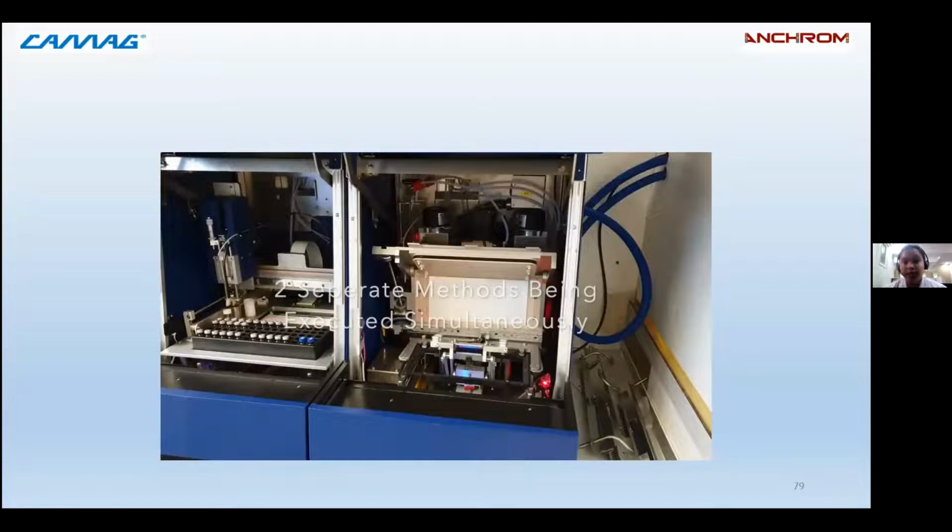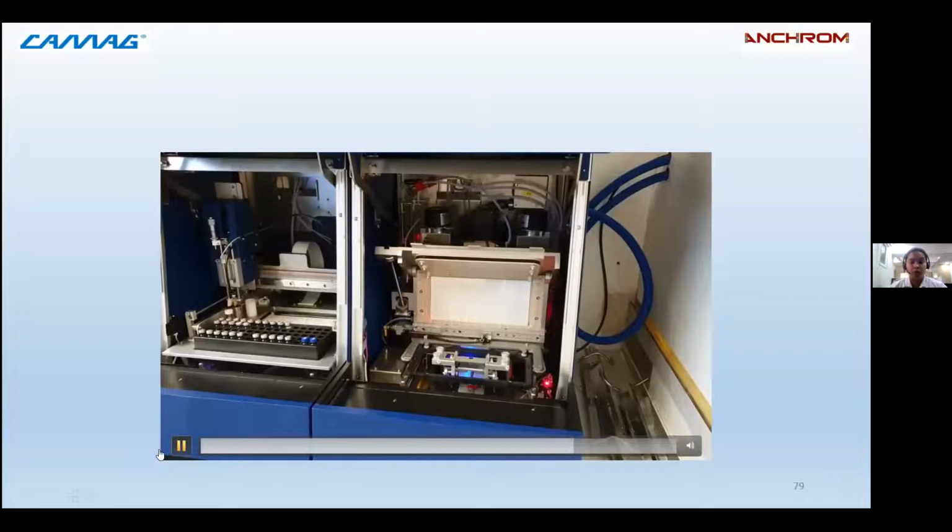So like this you can do simultaneous estimation, but this unit will be an automated one, specially designed for QC purpose, that is quality control purpose, where they have a fixed method. They just have to start the method, and it will automatically go to the applicator. It will do the application, then it will go to the development. So all the things will be done automatically, which nowadays we have to do manually. According to the QC department, the manual error is more, but now the manual error will be eliminated because it is an automated system and a closed box.